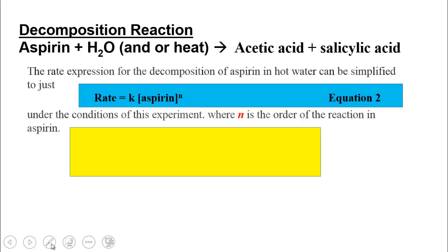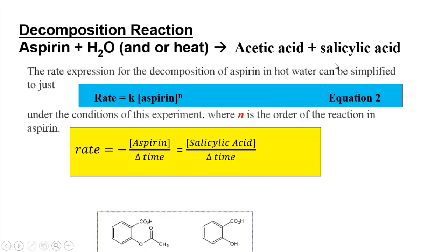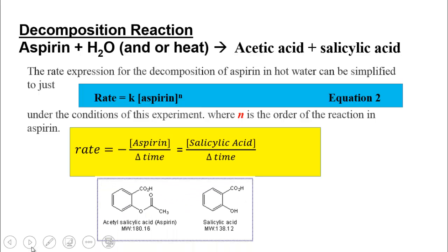And from last term, we all remember this fun stuff. So again, we're going to be monitoring this reaction by looking at the salicylic acid.